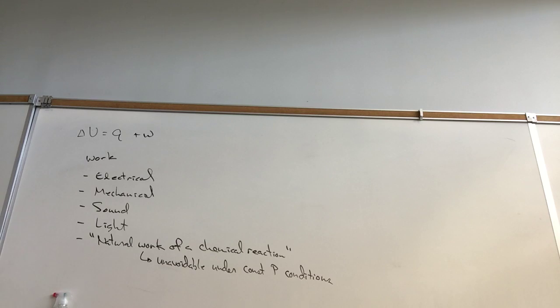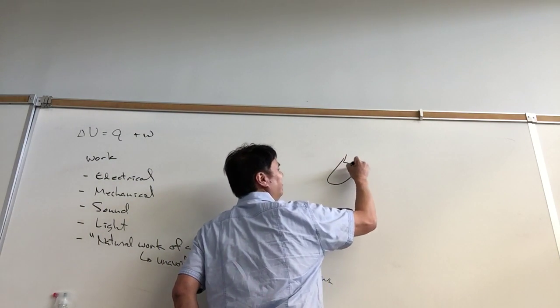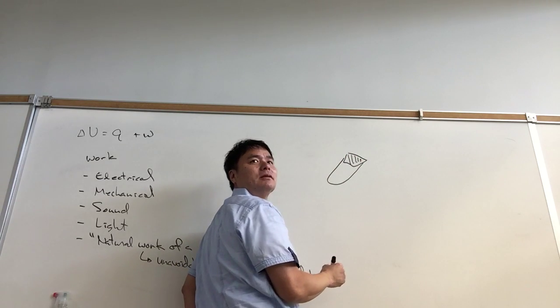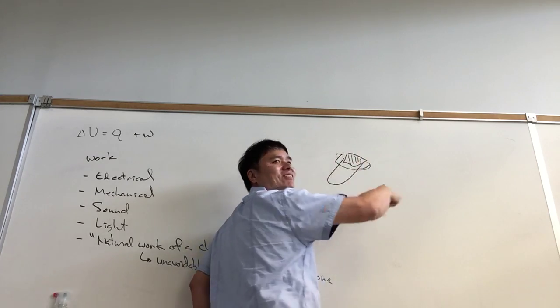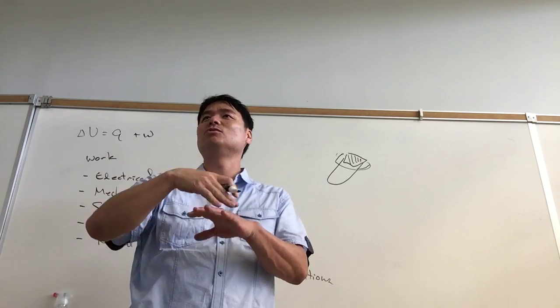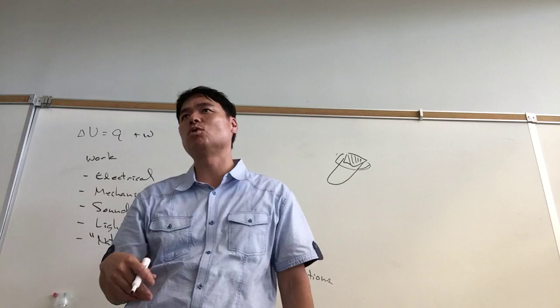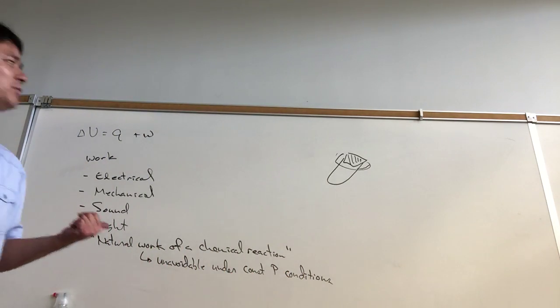Well, actually, you could have avoided it. You know one way to avoid that? If I just use a solid stopper and then duct tape it. Just tape a stopper onto the test tube so that the O2 wouldn't have to force any water out, do any work, right? But if I did that, what's going to happen?